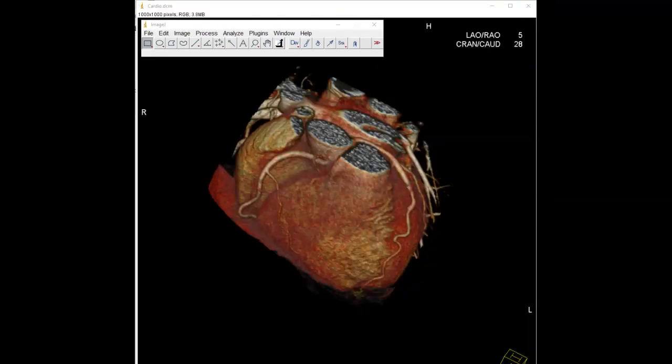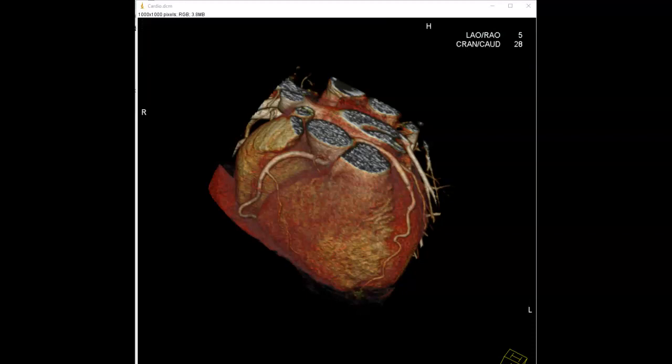Presentation is going to be on ImageJ. ImageJ is a public domain Java image processing and analysis program. ImageJ is used in the scientific peer review community where thousands of articles have been published in such fields as the life sciences, astronomy, and physics. In life science, it's used to quantify medical images to aid in the detection of pathological markers.